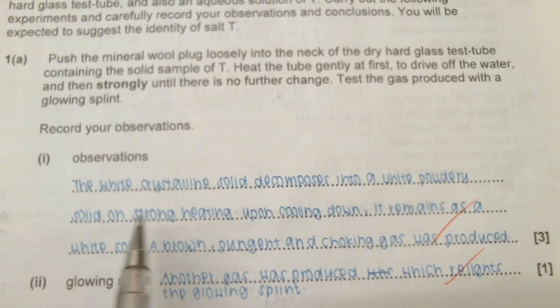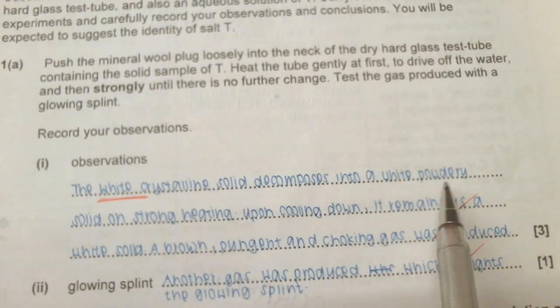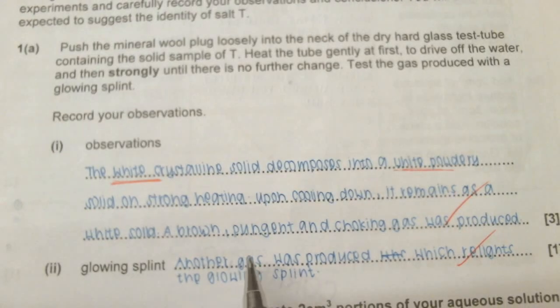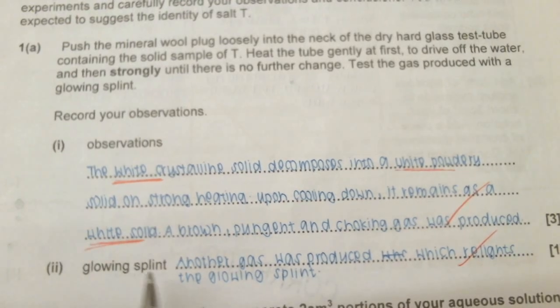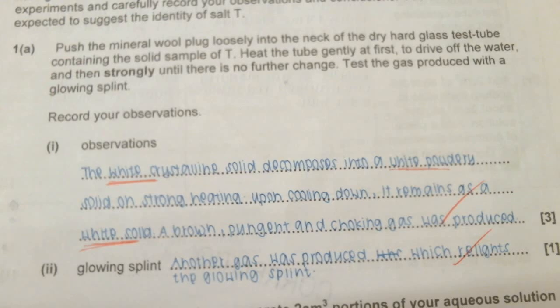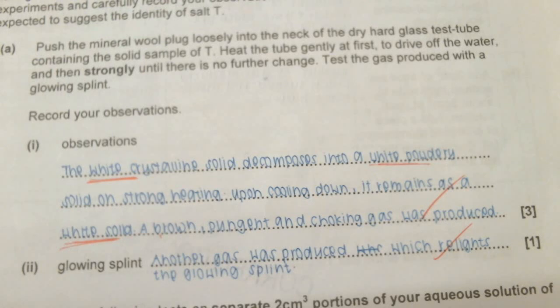a substance strongly. So this student has written it correctly to describe the color of the solid before it was heated, and then upon heating strongly, what color has it become? On cooling down, it remained a white solid. She also wrote down the color. You need to write down the gas or any gas produced while you're heating something strongly. In this case, you see a brown pungent gas was produced. And there was another gas, and the gas relit the glowing splint.